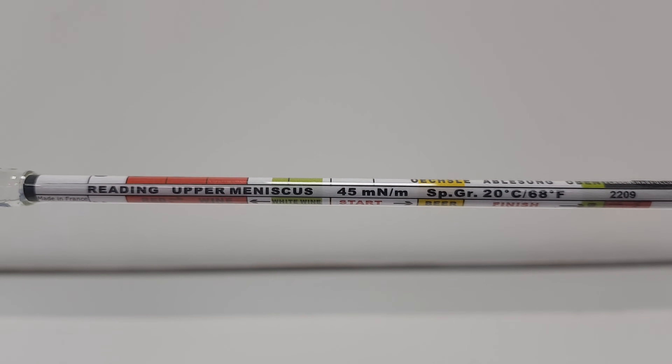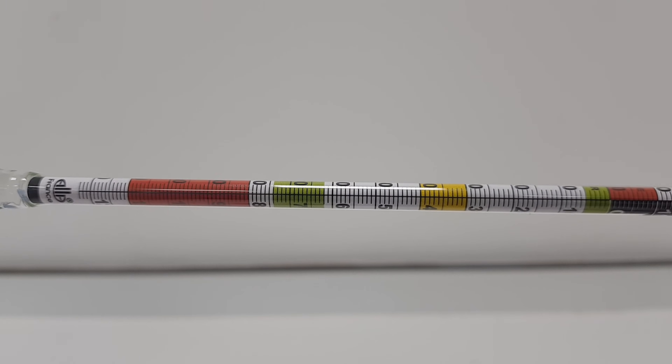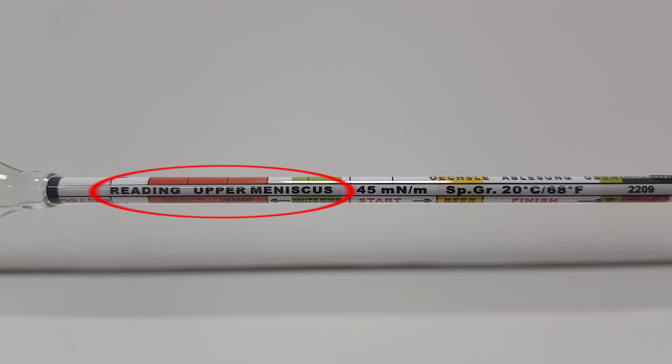Before you start, be sure to check over your hydrometer carefully. Many use different scales, such as specific gravity or potential alcohol, and some require you to read from the upper meniscus rather than the lower. Also note the temperature that it's calibrated to.